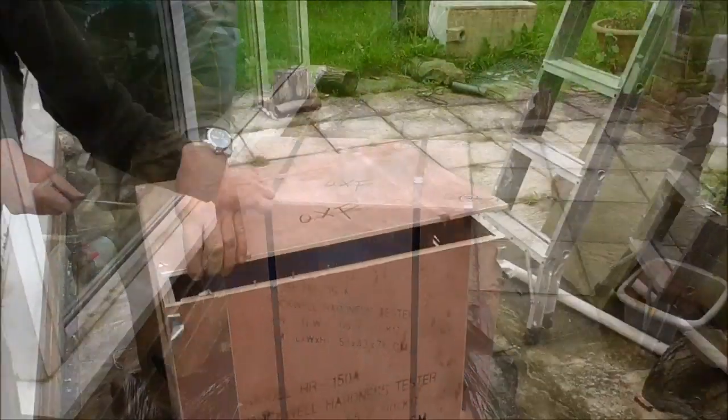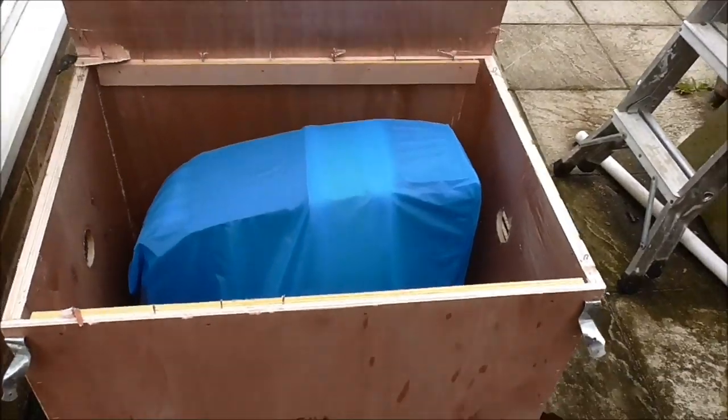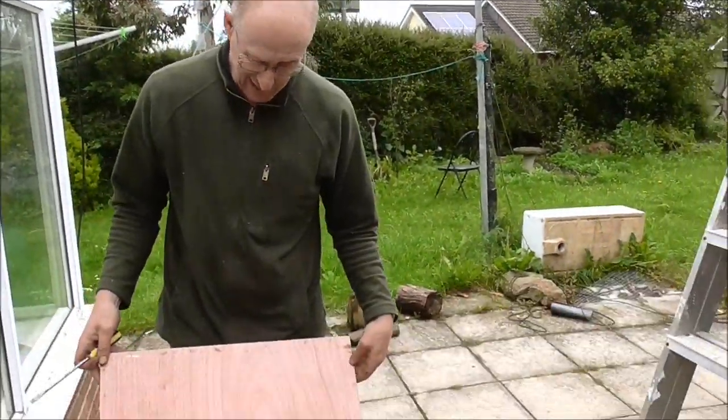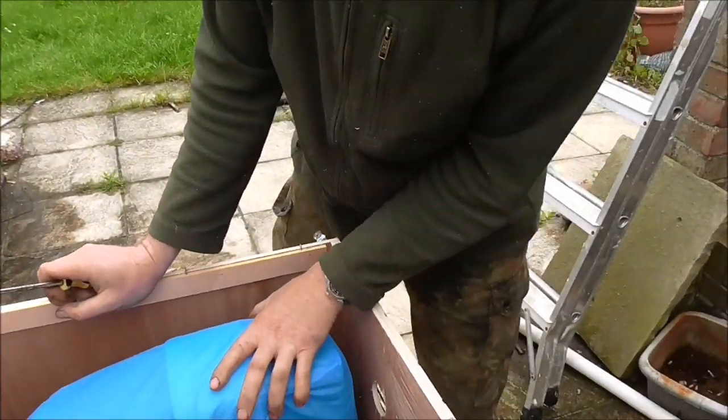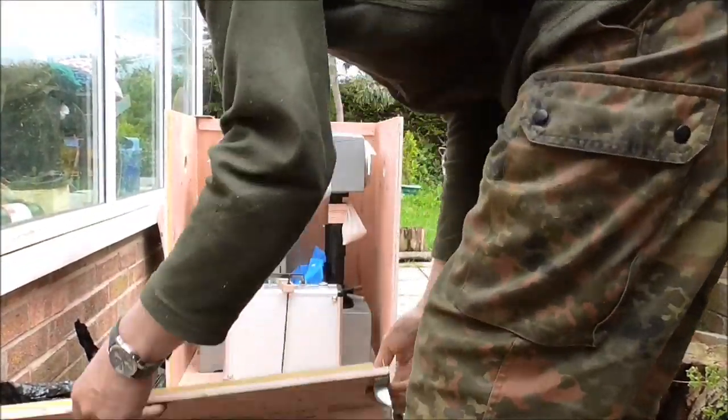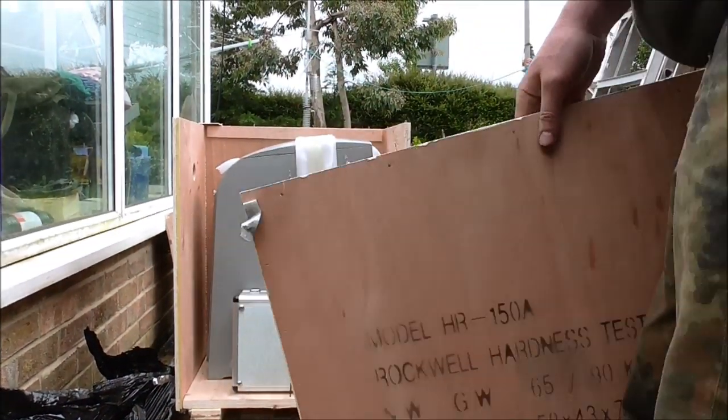Right, I'm going to get it undone. It's yet in another batten. Got into all this. It's a mean machine isn't it? Well wrapped, well wrapped and packed isn't it? The old thing's in the way.